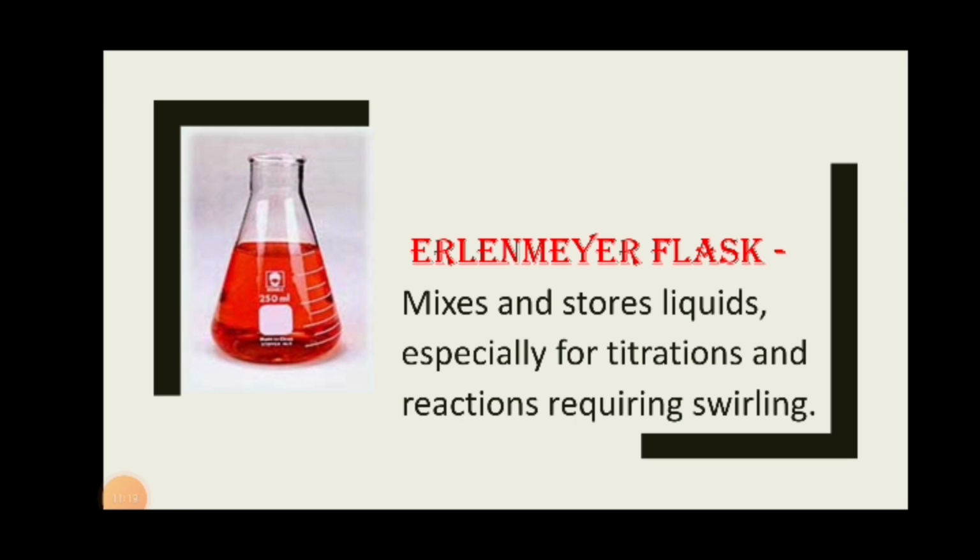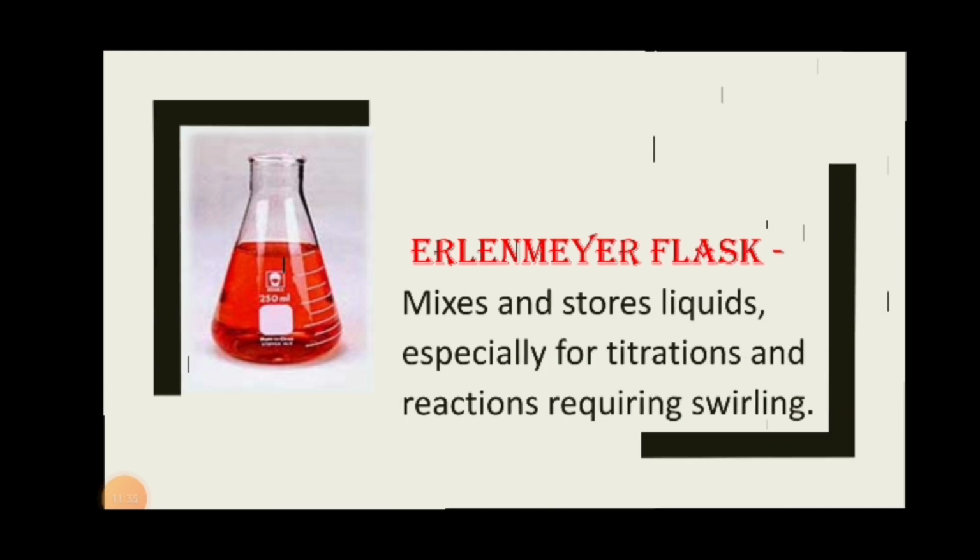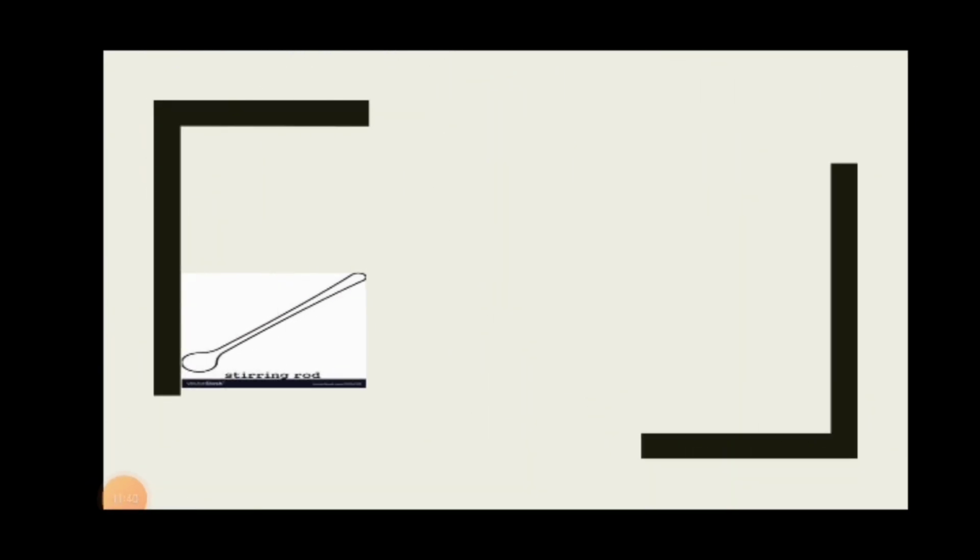Kung gusto mong mapareact directly without using a stirring rod, swirl mo lang yan using your hands in a clockwise or counterclockwise manner. It depends on how comfortable you are. So that's Erlenmeyer flask. And next is, what's this one?